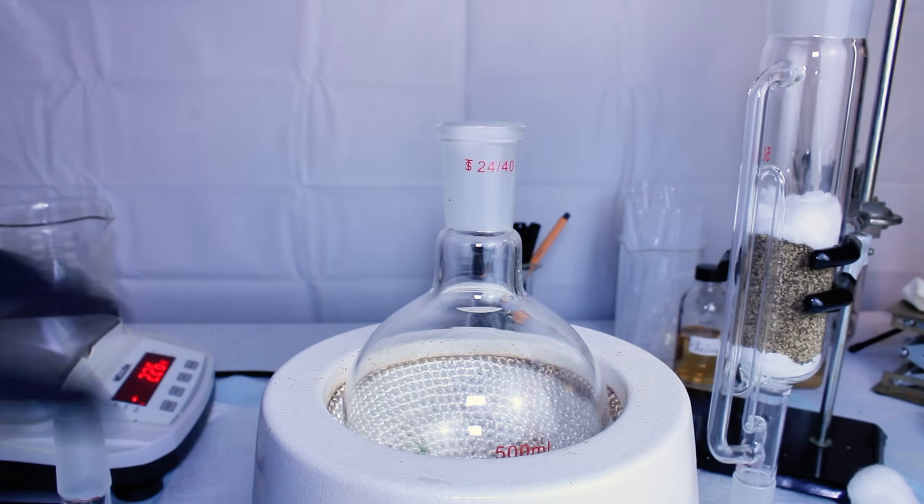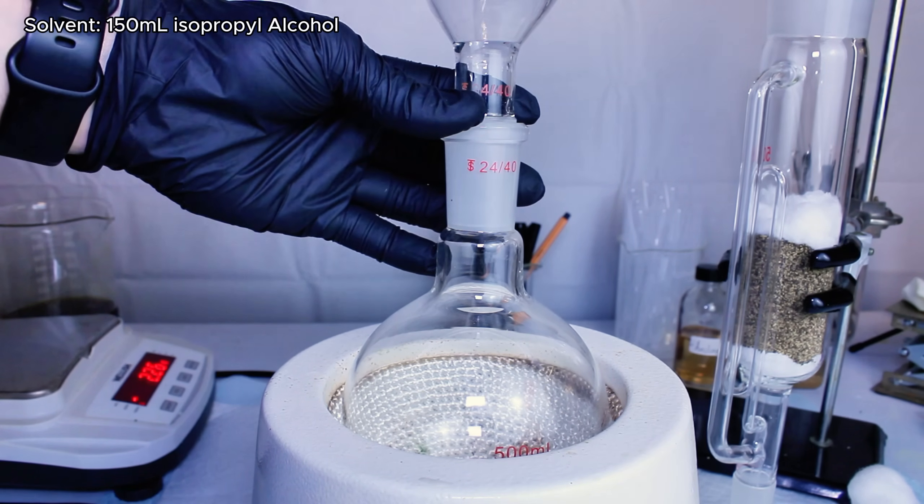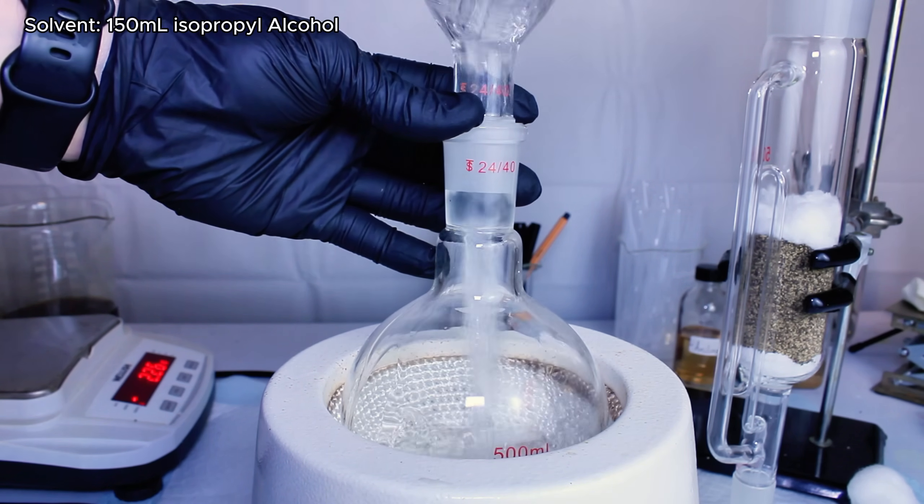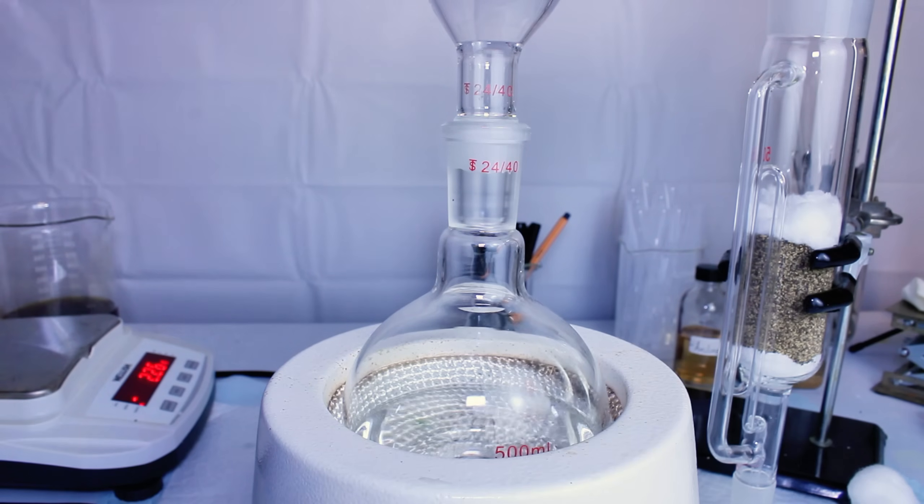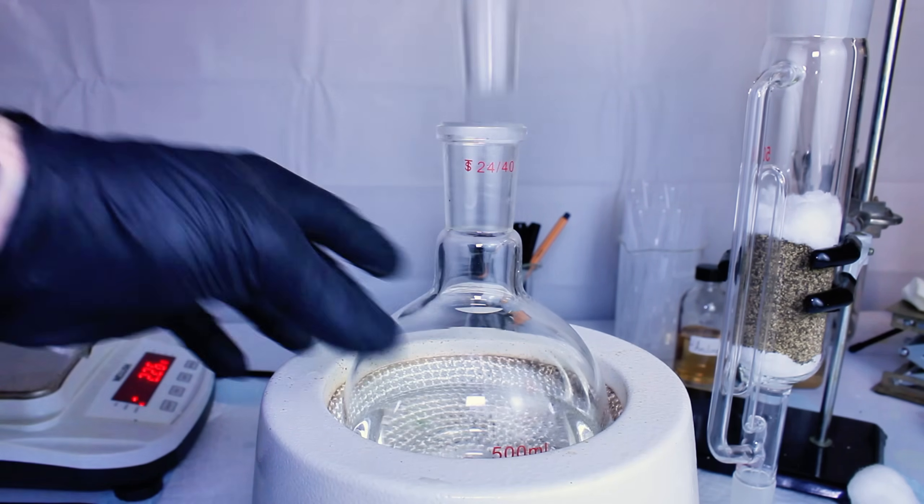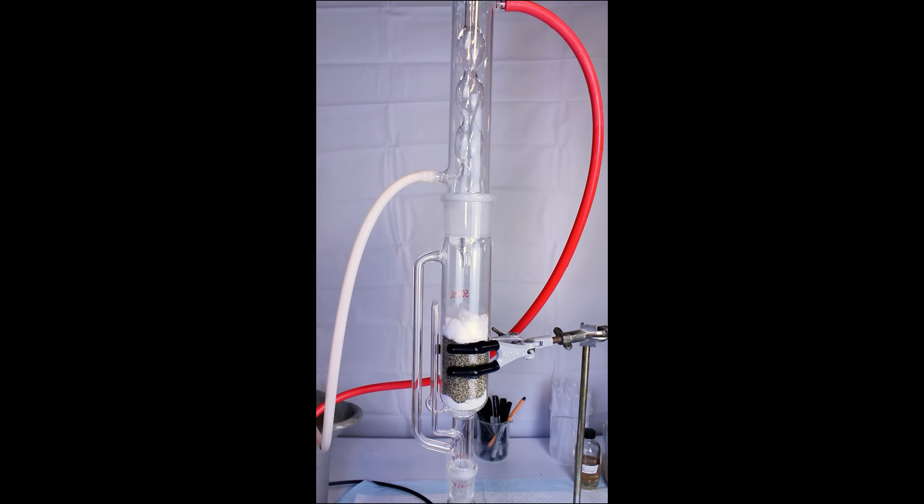I go ahead and set this aside, and then I pour 150 milliliters of isopropyl alcohol into a 500 milliliter boiling flask that's situated in my heating mantle. At this point, I just need to construct my extraction apparatus, and to do this, I simply connect my Soxhlet Extractor to the boiling flask, and then I connect an Allihn condenser above the Soxhlet Extractor.